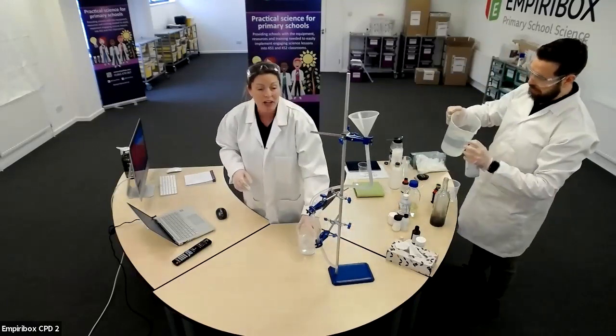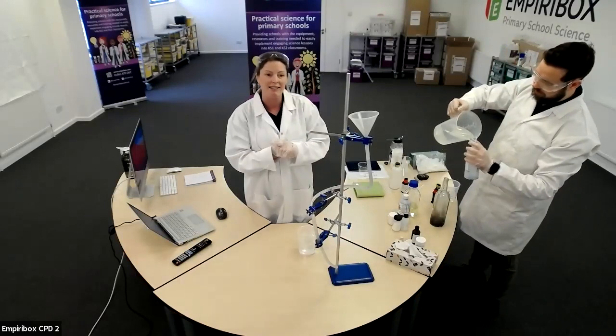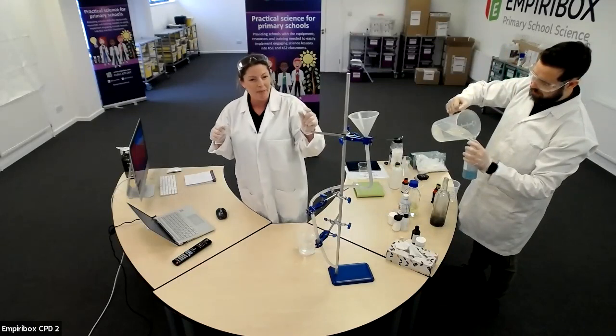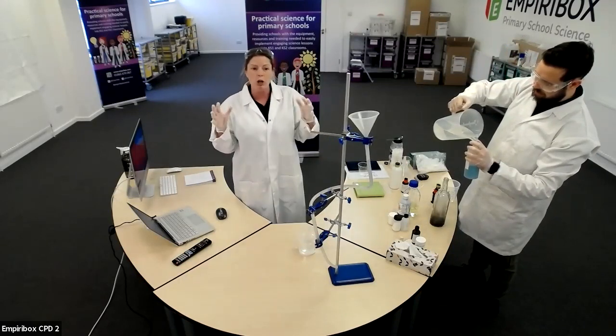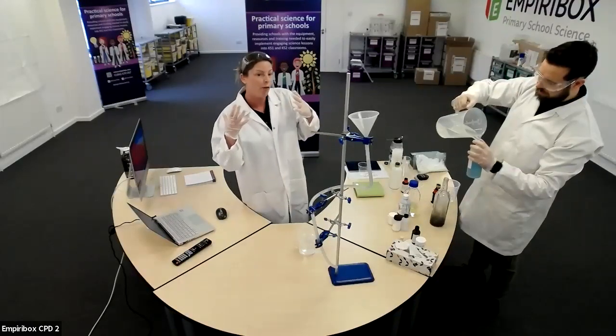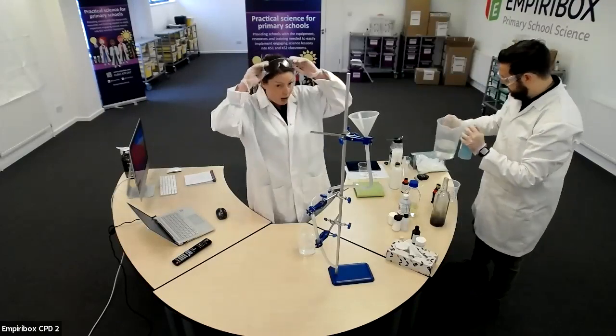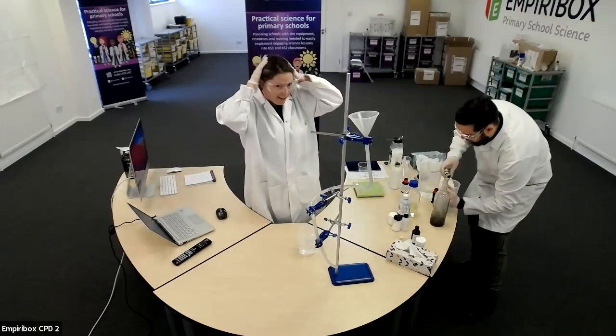So what we're going to look at here is an example of chemiluminescence. Now that's a really, really big word, isn't it? But chemi because we've got chemicals involved, and luminescence because it's giving off something. And I want you to have a look at what happens in a minute. Okay, so I'll pop my goggles on. Thank you, Rose, for the reminder there.